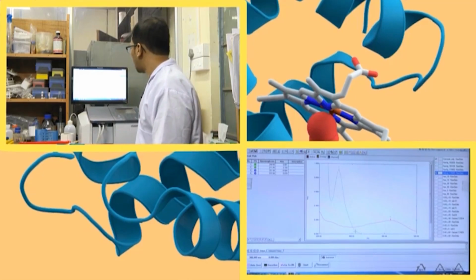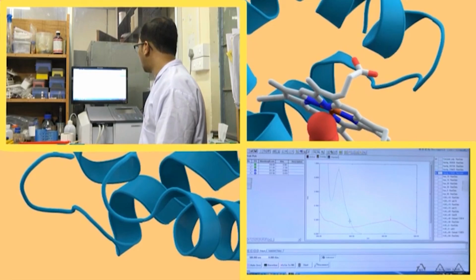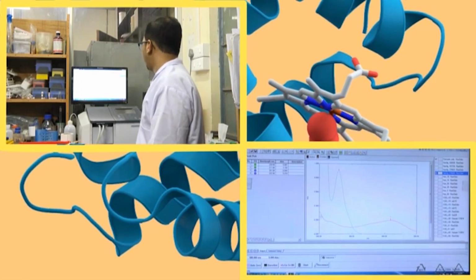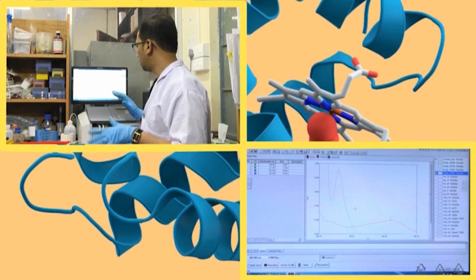And there is another small hump which you can't actually see from here, but it is shown around 250 or something like that. It is not properly visible, but this 260 region gives an intense peak. And if we compare curcumin and gallic acid, we can see that they have distinct absorbance peaks.